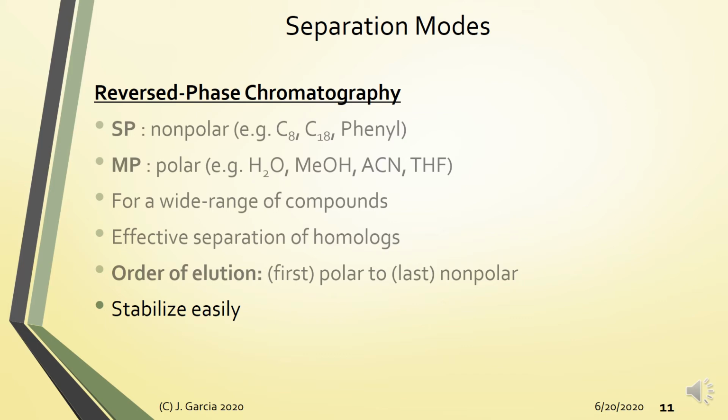Normally, starting from methanol, you attach the column, turn on the pump, and pump in pure methanol for around 10 to 15 minutes at a low flow rate. Then you decrease the methanol content by adding more water, say a 50-50 water-methanol mixture, increase the flow rate, and pump for several minutes. Then afterwards you go to pure water.